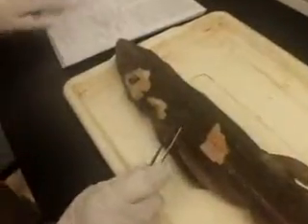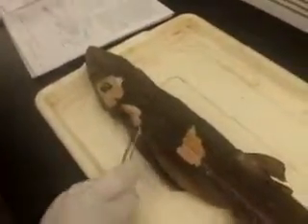This is Mike Cummings, and this is the shark musculature identification lab. Okay, so first let's start off with the myomeres. The myomeres are these large orange stripes. You might not see them, and they originate from the vertebral column.